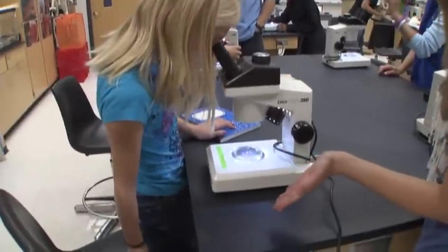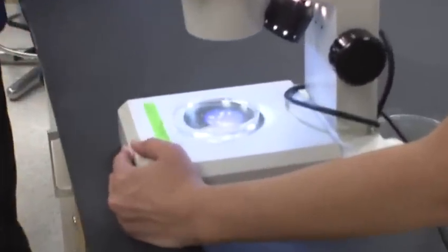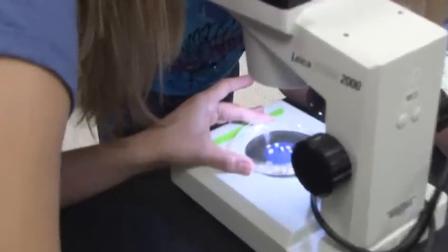Is he moving at all? Let's see if we can get him to move. I'm not even sure if it's changing. They're all kind of the same shape, but the patterns on them are really different. I know he's moving, but he was well adjusted and clear. Let's see if I can get him to move for you. Look, it says snail babies and insects. It looks really cool when he does. No, put on the extra light underneath.